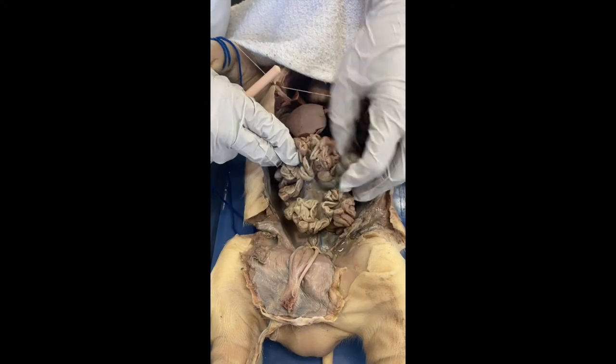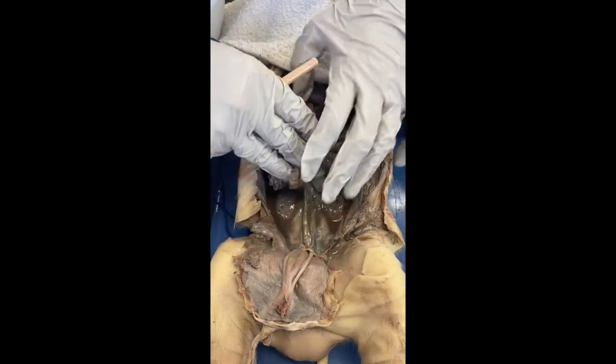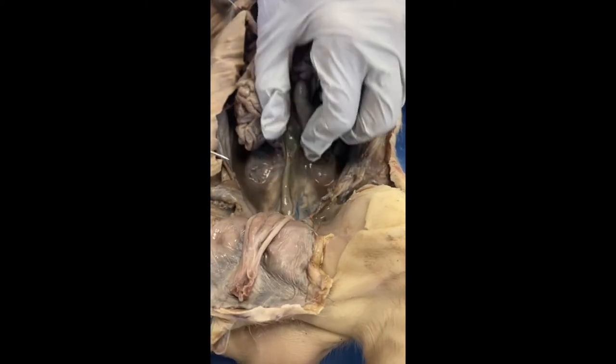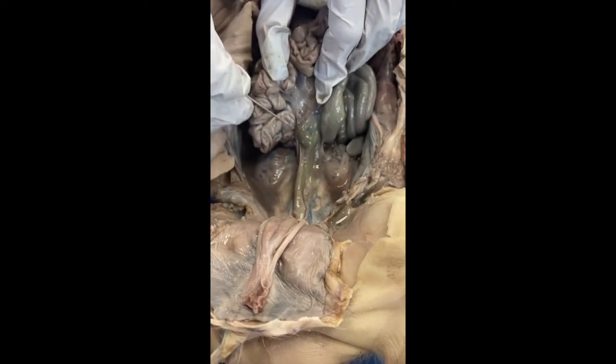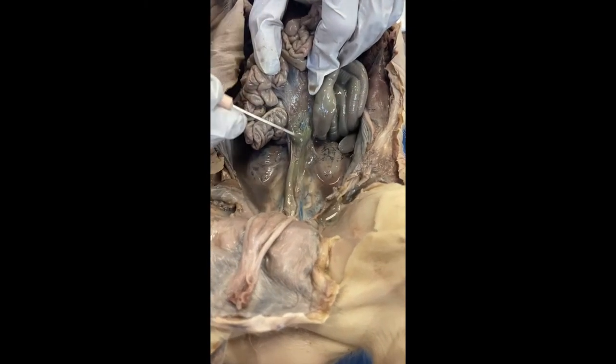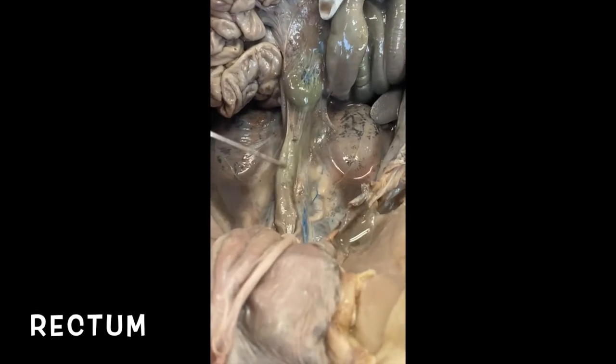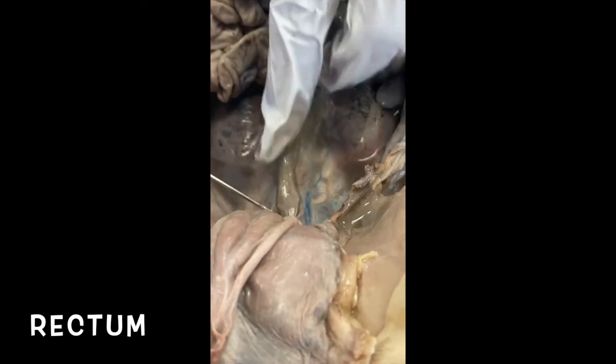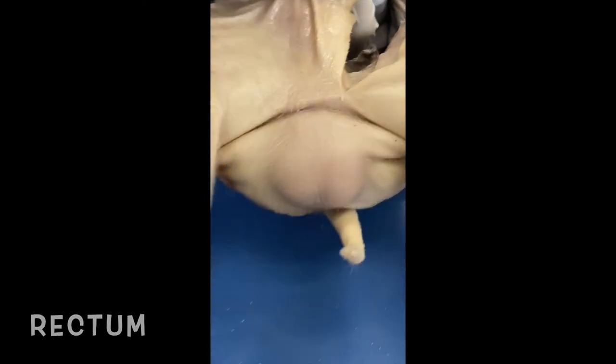If we pull up your intestines, there's the end of the intestines right there. You can see it. This is the rectum. And this is where your waste is going to go out. It's going to go all the way through here and then out the back.